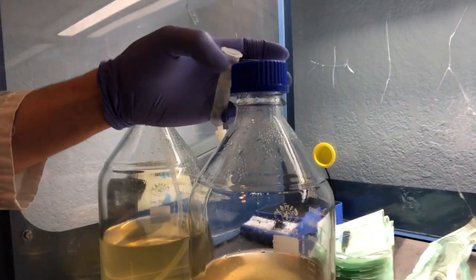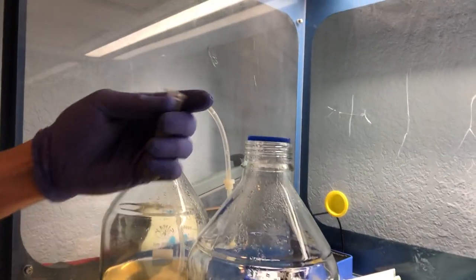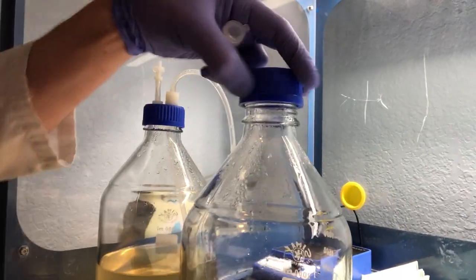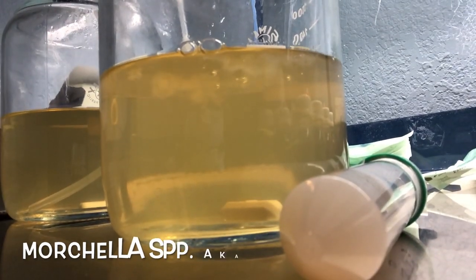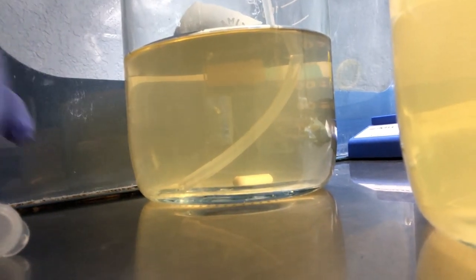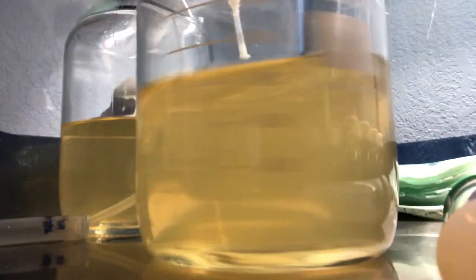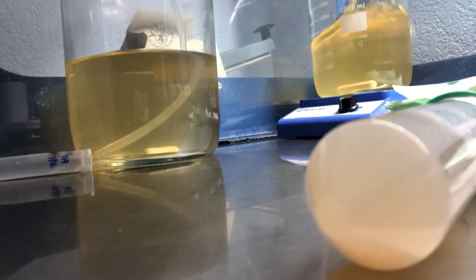So I'll just go ahead and take this cap, set it over here. You can see the mycelium right there. So that is Morchella, or morel species. I'm going to wait a few days to QC this liquid culture. All right, so there's the mycelium in solution right there. And then I'm going to incubate this for about 3 or 4 days by placing it on the stir plate here.